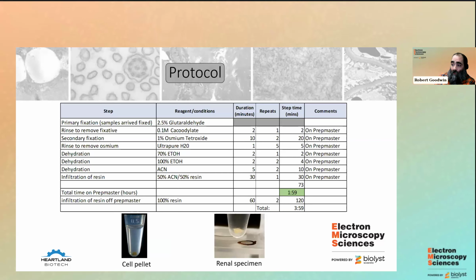We used to do the 100% resin in this as well. It has the capability. One of the pieces of equipment in there will heat up. You can set it to 40 degrees or whatever you like to have your warmer set at. But we just found that changing the resin in those little PCR tubes was a challenge. So we just run it through 50/50, and then our changes of resin we just do back in the tube that it came in. It's just a little easier that way.